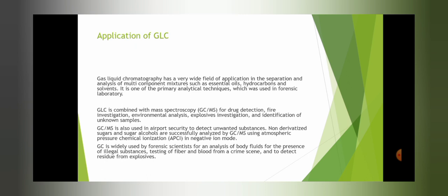The last application is that GC is widely used by forensic scientists for analysis of body fluids, e.g. sweat and urine, for the presence of illegal substances, testing of fiber and blood from the crime scene, and to detect residue from explosives.